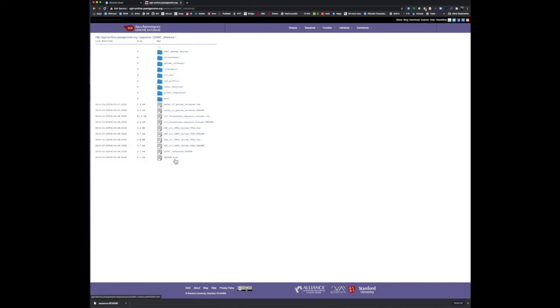And again, you would have to spend about a good half an hour probably really understanding what each of these files are. I'm not going to go through them all here, but it's definitely where you spend a bit of time. I can just show you here, open that with my text edit.